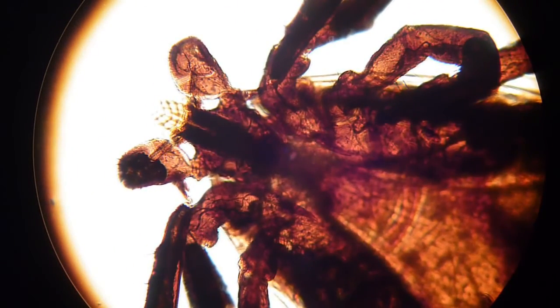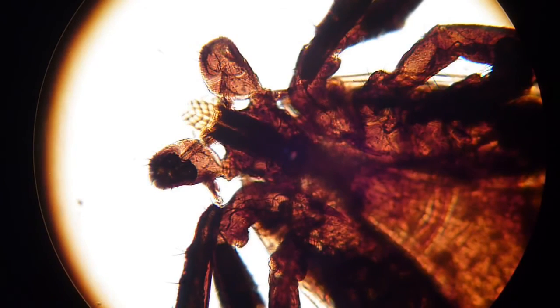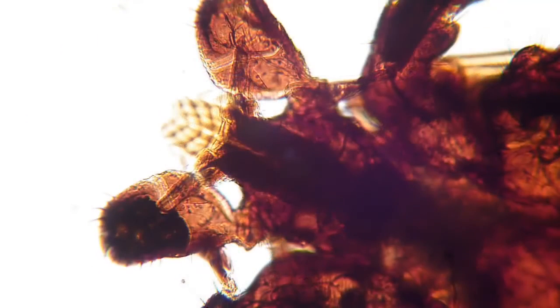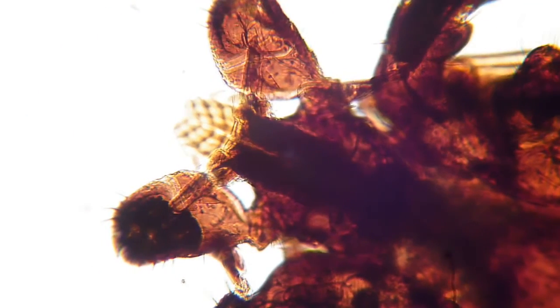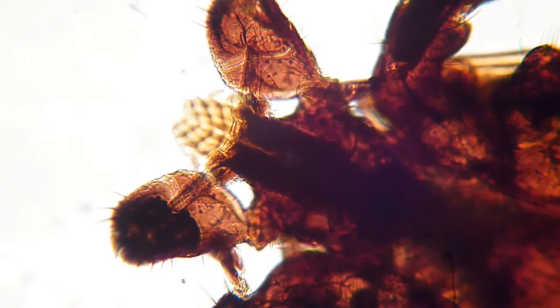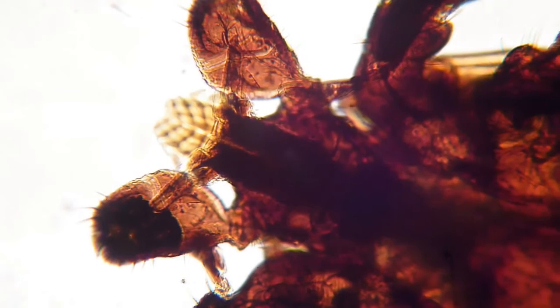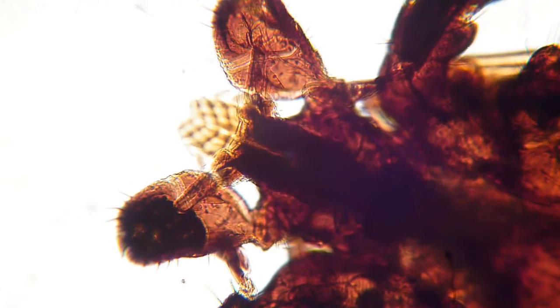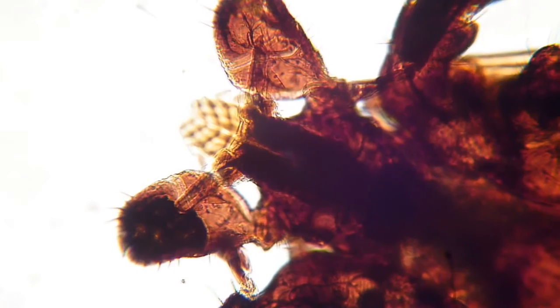I want to actually go to yet a higher magnification. I have to use the camera here to zoom in a little more. That is again the head part. Now I don't know what it's called, this thing where the tick actually uses to bite through the skin. Is it called the proboscis maybe? In any case, in butterflies it's called like that. I don't know about ticks.